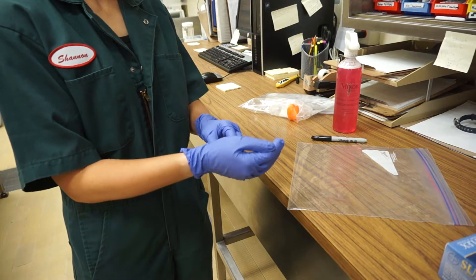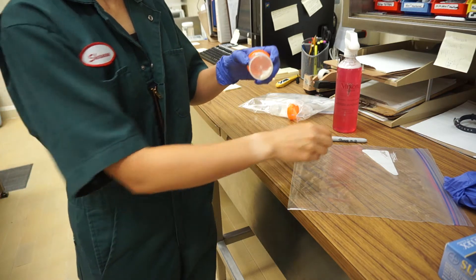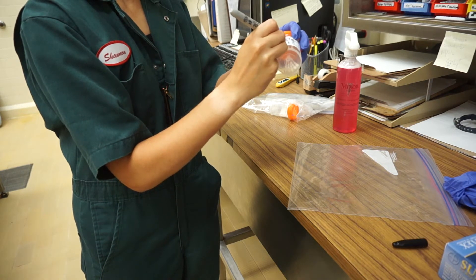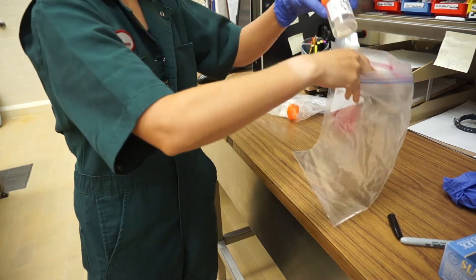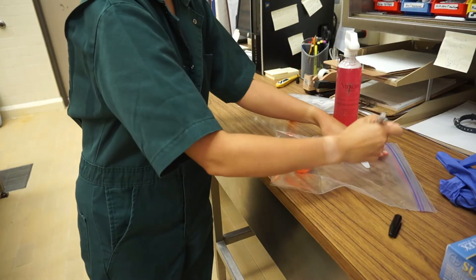In the clean area, take the glove off your writing hand. With your uncovered hand, write your barn name and pit numbers on the orange top container. Place the container in the Ziploc bag. Now take off your other glove and write your barn name and pit numbers on the Ziploc bag.